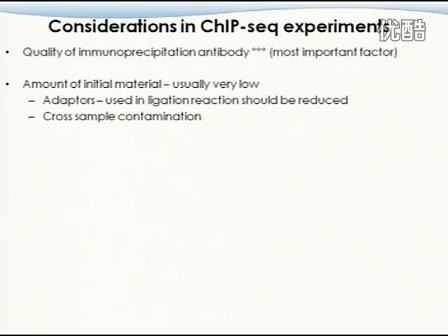But when you do ChIP sequencing, you have the cell, and then you have the antibody to target that small region in the DNA. And that is such a small fraction of the entire DNA. So even though sometimes you start from a huge amount of material, you eventually will end up with very, very low input material for the sequencing part.